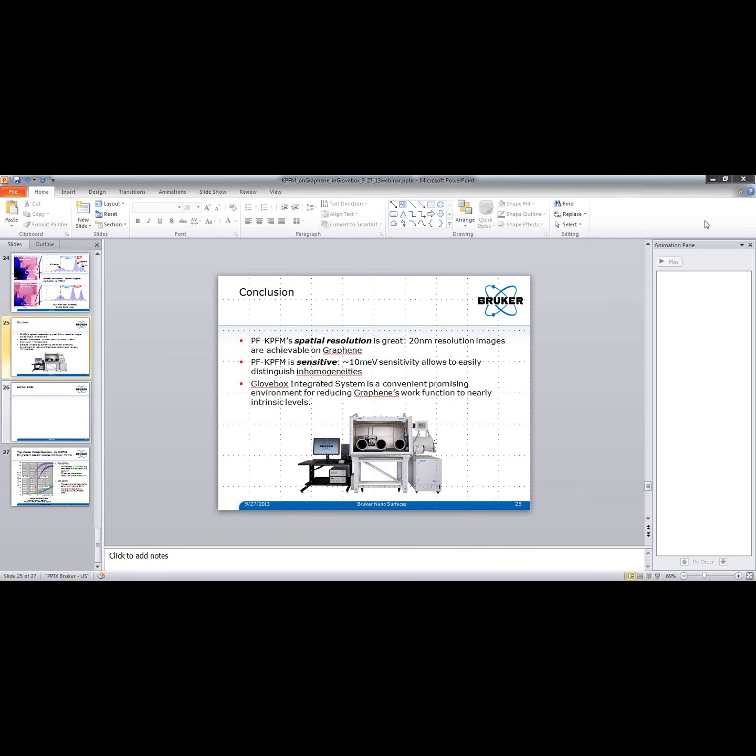Okay. And then along the same lines, why does graphene become an insulator if the dopants are removed? If you have absolutely no doping, then graphene is not an insulator. Theoretically, if you have equal numbers of electrons and holes, then you're at what is known as the Dirac point. At that point, you have equal numbers of electrons and holes which have equal mobility. Therefore, the net conductivity of graphene becomes 0. But it's only at a certain single point, and you can only really achieve that point at 0 Kelvin when you don't have any thermally activated carriers.